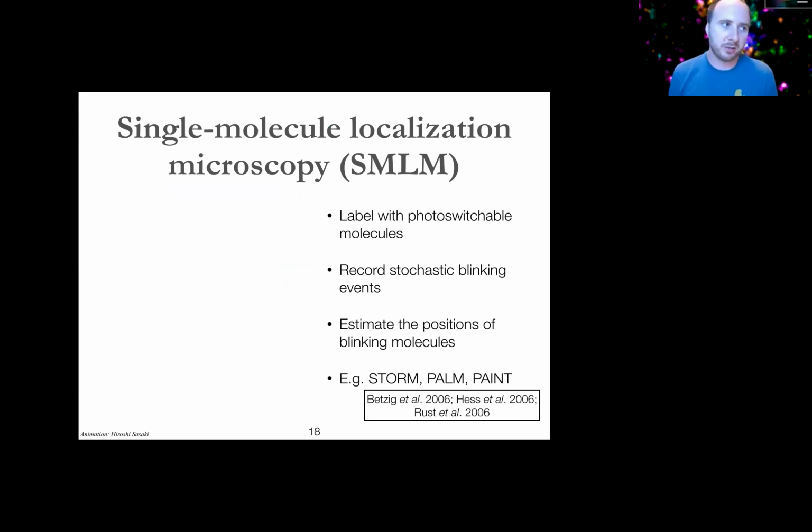So there are multiple ways around that problem, including just doing some clever tricks with diffraction limited imaging that I don't have time to talk about today. But the other avenue is to use some kind of super resolution microscopy that, as the name would suggest, just attempts to get around or below that diffraction barrier in some way. There's a lot of different kinds of super resolution microscopy, which I wouldn't have time to go through all of, although I'm happy, in the questions if people have questions, to try to answer on that front. I'm going to talk specifically over the next few slides about a certain type of super resolution microscopy called single molecule localization microscopy, or SMLM.